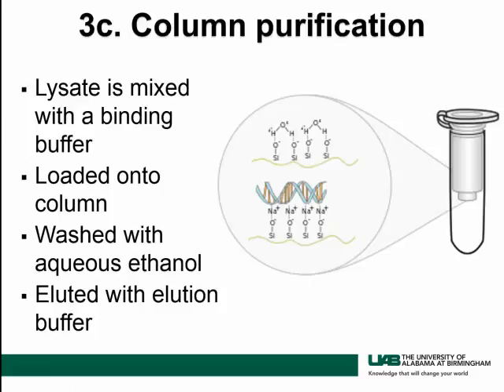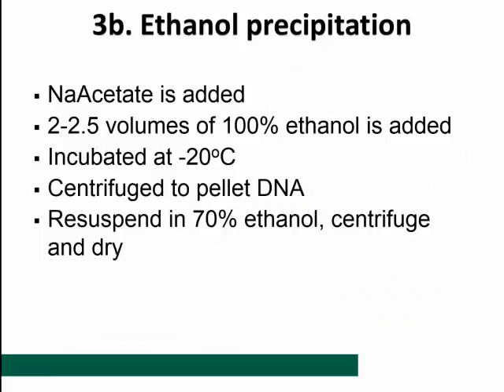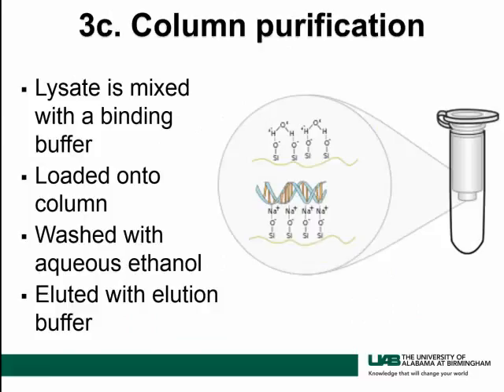So when you add the binding buffer, and you add the DNA solution to the silica bead, the silica will grab the DNA and hold on to it, and you can actually wash several times to remove all kinds of impurities. Now, how you elute that is that when you add water, you are diluting out the competing sodium with the water, and so now water interacts with the silica bead, and it will free the DNA, and DNA is going to be eluted off of the column. And so the three ways that you can purify that DNA from the cleared lysate is by cesium chloride centrifugation, by ethanol precipitation, or by using a column. And column isolation of DNA takes these days less than 15 minutes.